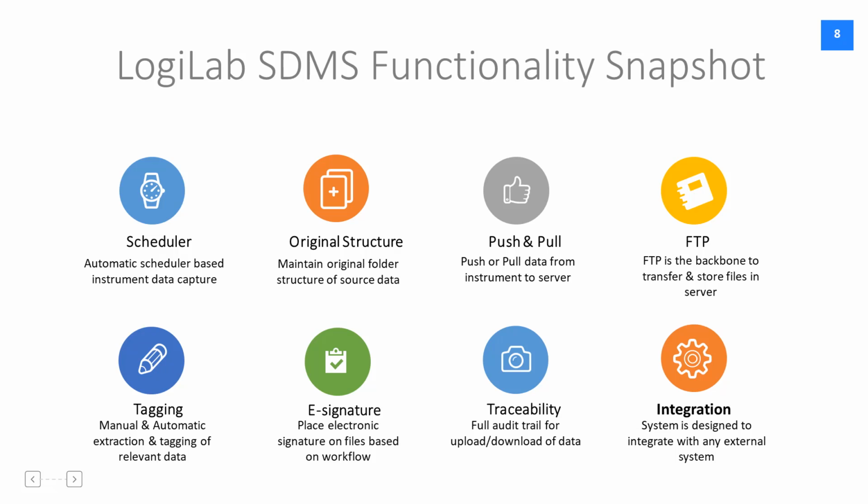LogiLab SDMS also has a push and pull mechanism for pushing data from the source to the server, as well as pulling data from the server directly, so that you don't have to install anything on the instrument PC. All your data is being stored in a FTP server, which is the backbone for the entire system for file storage.